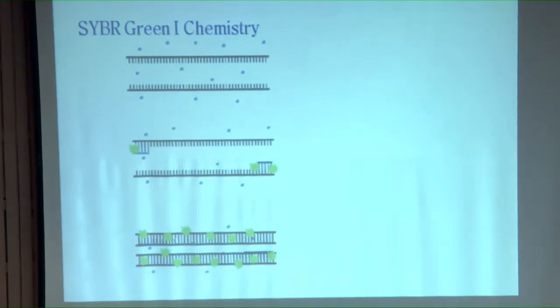You tell me what is the status of the template DNA? It is double-stranded, correct? And in terms of quantity, how much double-stranded DNA is here? It may be around 30 nanograms or 15 nanograms. All of you know how much starting DNA you use in a PCR mixture? It is at the nanogram level, and most often we use around 30 to 50 nanograms, right?